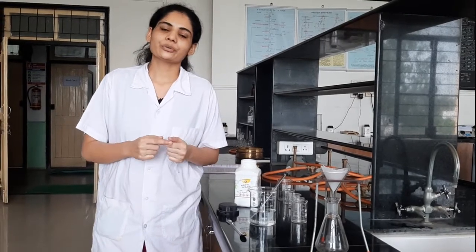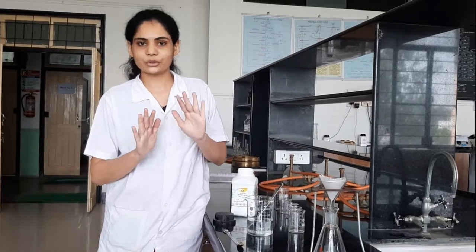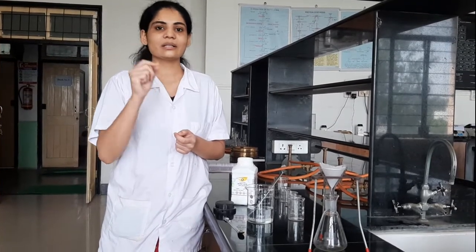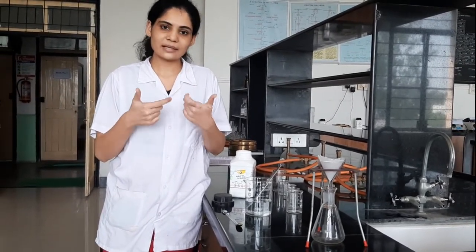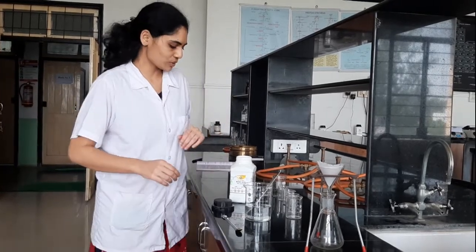We have to allow that 30 ml to cool down for 10, 20, 30, 40, 50, 60 minutes, and then we will filter out that solution and measure the particle size of the crystals formed at each time. From analysis of that particle size, we will come to know the effect of time on the rate of crystallization. So now we will proceed with our practical.